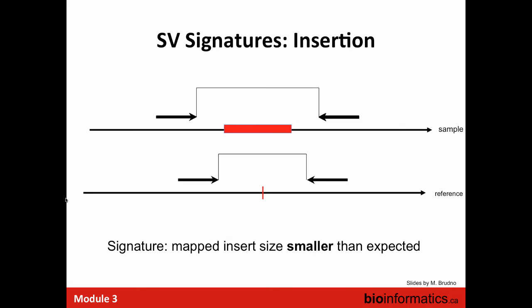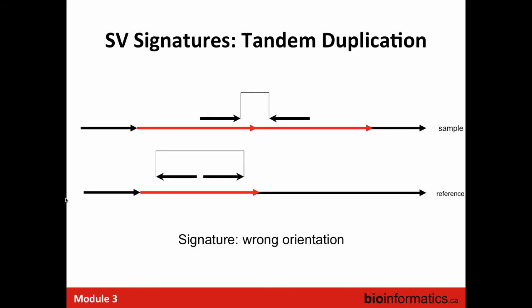Well, some of the other pair read could be within the insertion, in which case you just have the forward mapping and the reverse mapping somewhere else. Yep, where the insertion comes from. Yeah, it depends on the size of the insertion and what the inserted sequence is as well. I'm going to come back to that in a few slides.